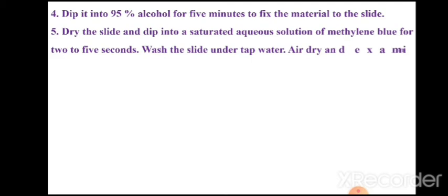Another advantage of ethanol is that it will act as a fixative. That means it will bring about the dehydration of that particular sample which is spread onto the slide. So due to this dehydration, the bacterial cells, the clumps, and somatic cells will remain stuck to the glass surface. So it acts as a fixative also. Then the slide is allowed to dry, and then it is ready for the next step.